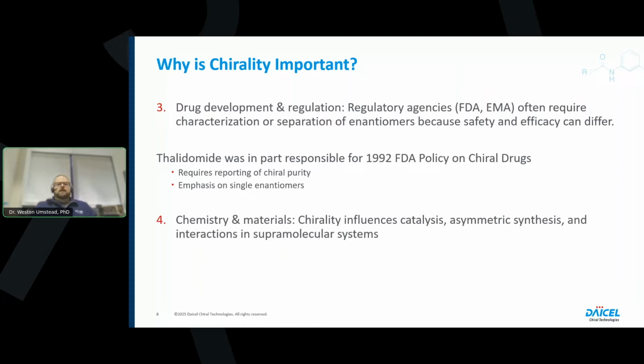Of course, there are other things like chemistry and materials. Chirality can influence things like catalysis and asymmetric synthesis. So we're not just talking about single small drug molecules. We can talk about really large macromolecules as well. Chirality can be a major influencer in those systems.